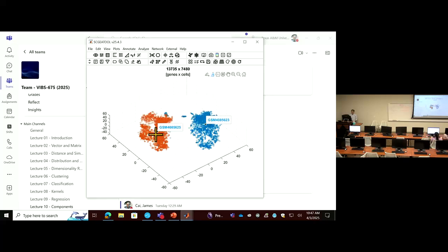Just remember you need to compare the same cell type. You don't want to compare this sample's cell type 1 with that sample's cell type 2. It has to be comparable samples in order to build the curve and make sense.